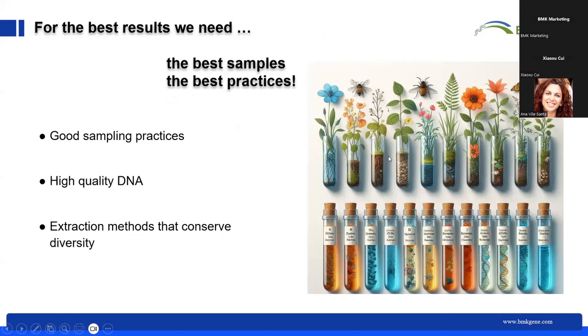So this is all that I had to talk about regarding sequencing. I would just like to take this last minute to focus on how our microbial sequencing projects can be designed to yield the best results possible. And for the best results, we need, of course, the best samples, but also the best practices. During this webinar, I focused on sequencing practices, but I would also like to highlight the importance of sampling practices, especially with microbial projects. Host contamination can be a problem. So good sampling really is important.